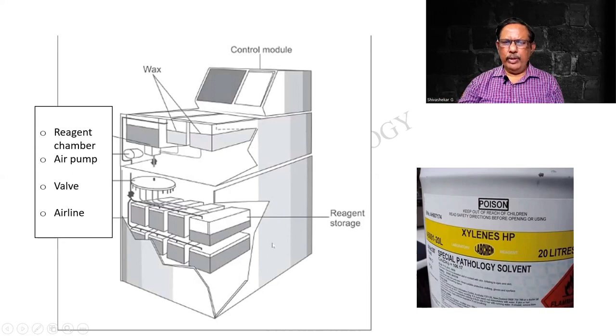So this is important. I have just shown xylene as one. We will have to take the precautions about the specificity of the reagent that is required and procure it from a good quality company. We should not compromise with it at all, because it will reflect on the processing of the tissue, as I will be showing you in a few examples.